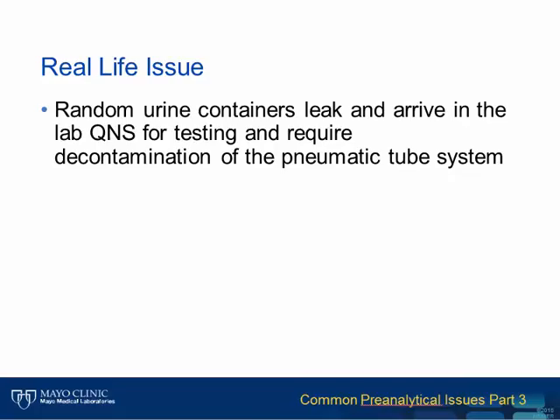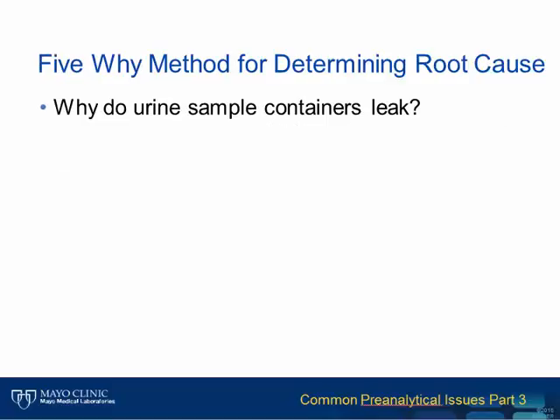The laboratory noticed an increase in specimens arriving to the lab leaking with insufficient volume to perform testing. At the same time, the maintenance department had contacted the lab supervisor, sharing concern that the increased number of incidents where the pneumatic tube system needed to be taken down for decontamination would adversely affect its lifespan before major maintenance was needed.